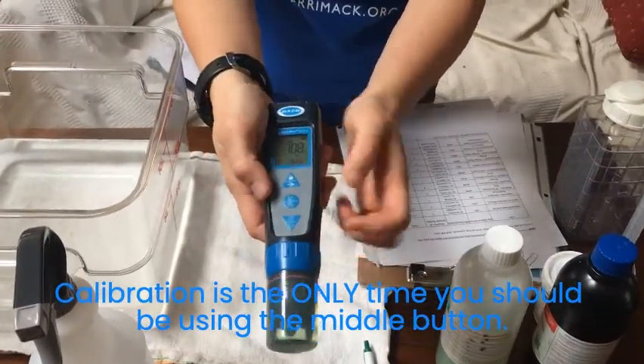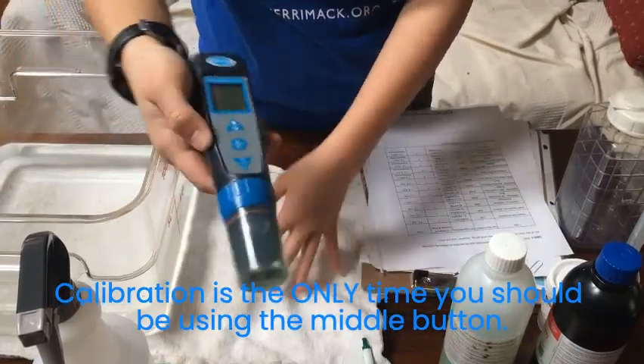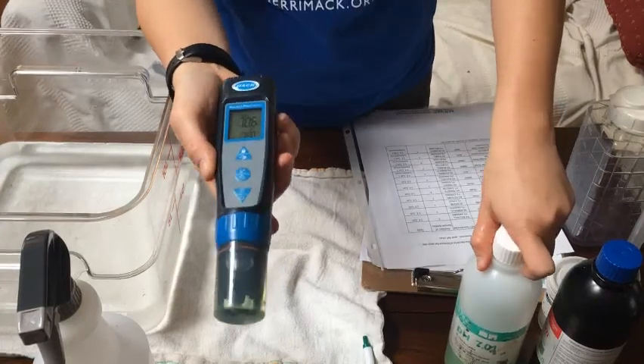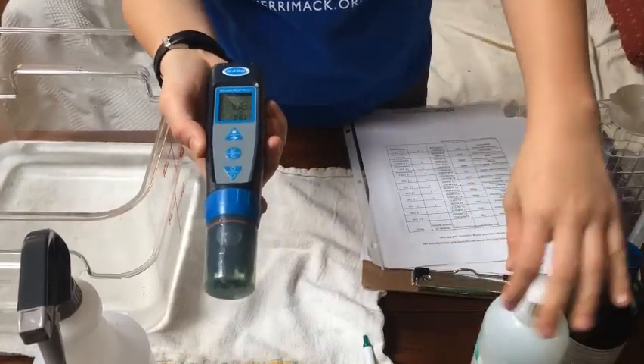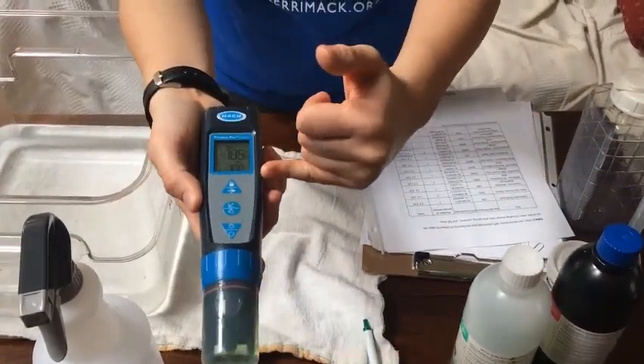In order to calibrate, you see this middle button — you're going to tap it once and you should see the calibration solution number. We give you a 7.01, and it should be pretty much 7 — that bottom number below.